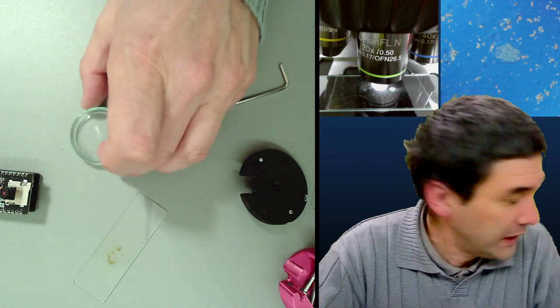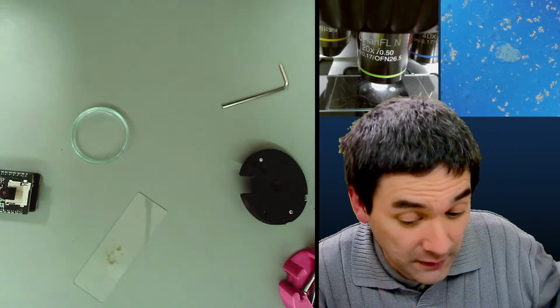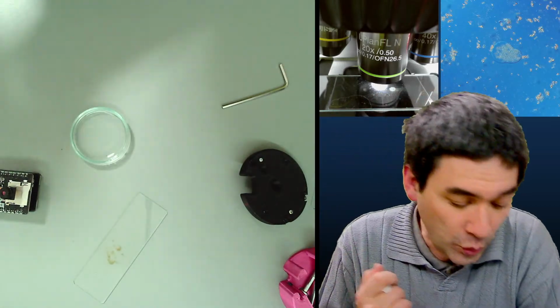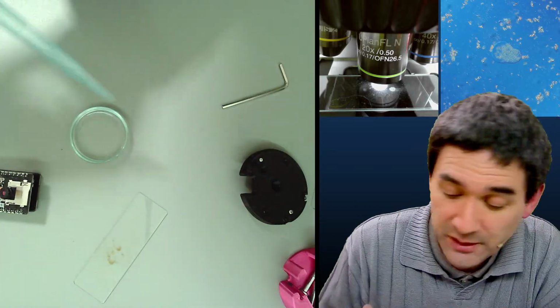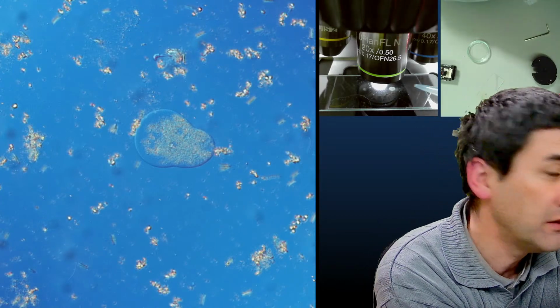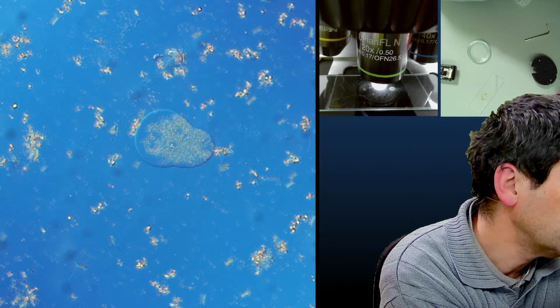Okay, let's try to expand the cell again. And if it's even a cell, I don't know, but it looks like one. It's also a fun experiment. How much can you squash it before you're able to revive it again? So here's some water. Here we go. And I'm going to add some water on the side of the slide. You see over here? Yeah, on the side here.